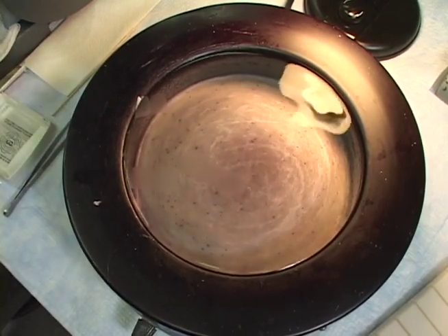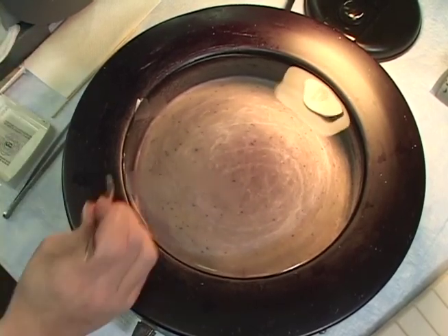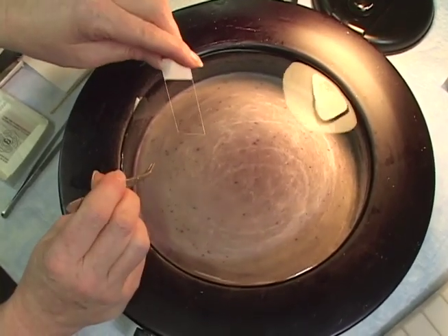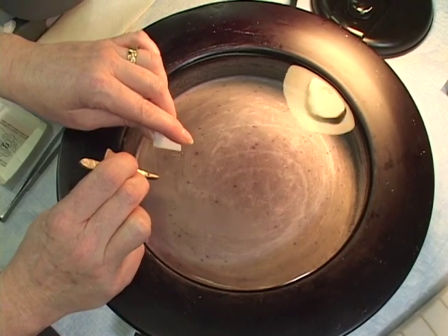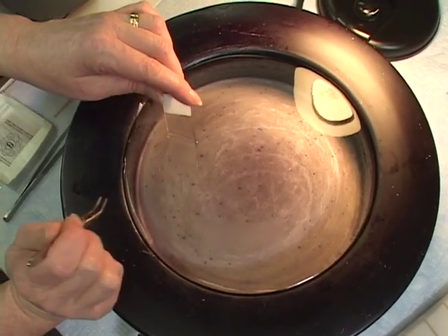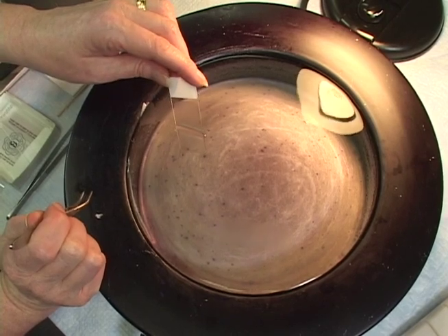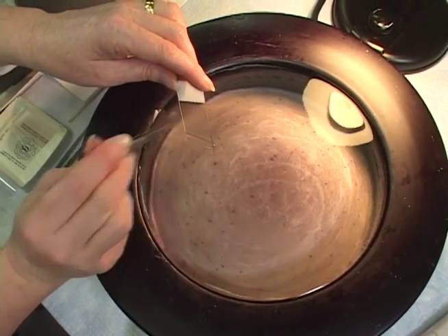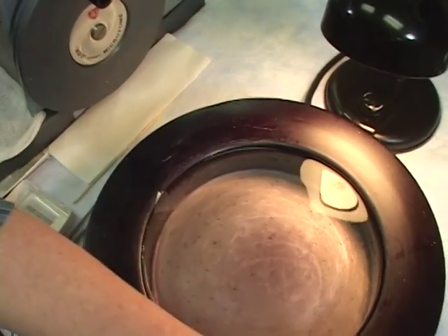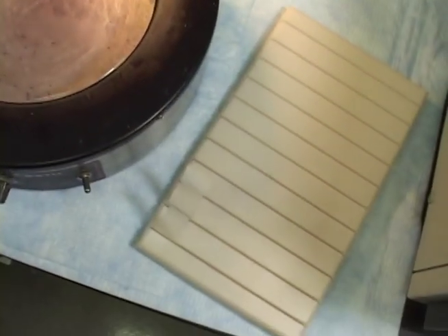I'll wipe off my forceps so I don't have extra stuff on there. This was the second sections I cut. So I'll gently steer them onto the slide so they don't slide down, because this is a non-charge slide at the moment that I'm using. I gently touch it and I pick it up and then put it in the slide rack to drain.